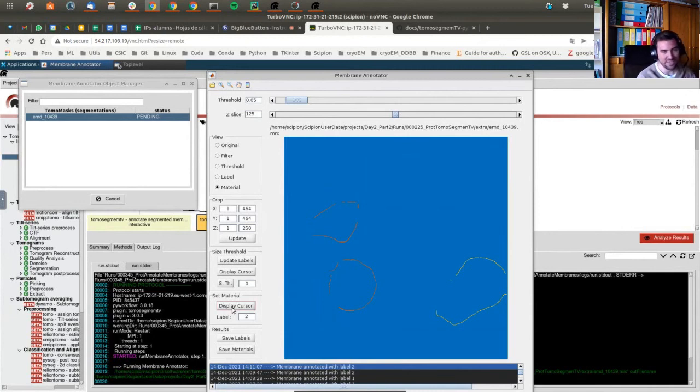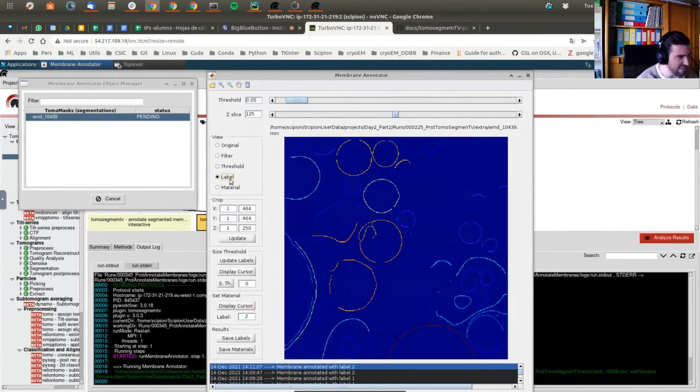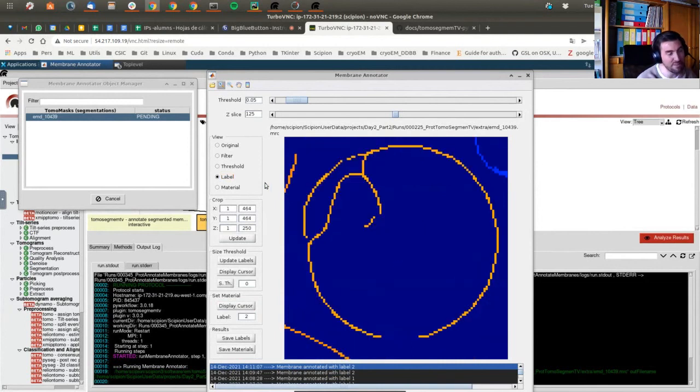So the easiest one, this is one. Let's go to the third one. Again, once you have familiarized with the tool, it's very, very easy. Just once you have in your mind the sizes and so on, it's just the same all the time. So let's go back to value, click on the magnifier. Remember, this is the third vesicle we're going to work with. Let's update the label to label 3.